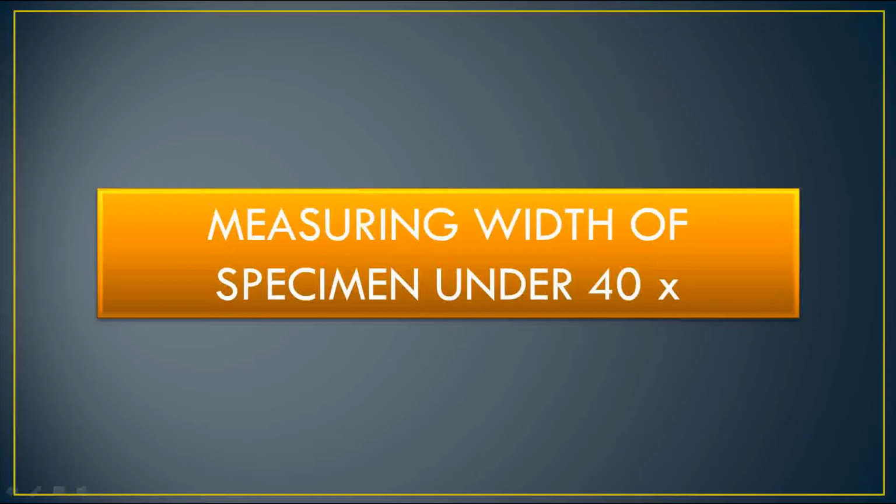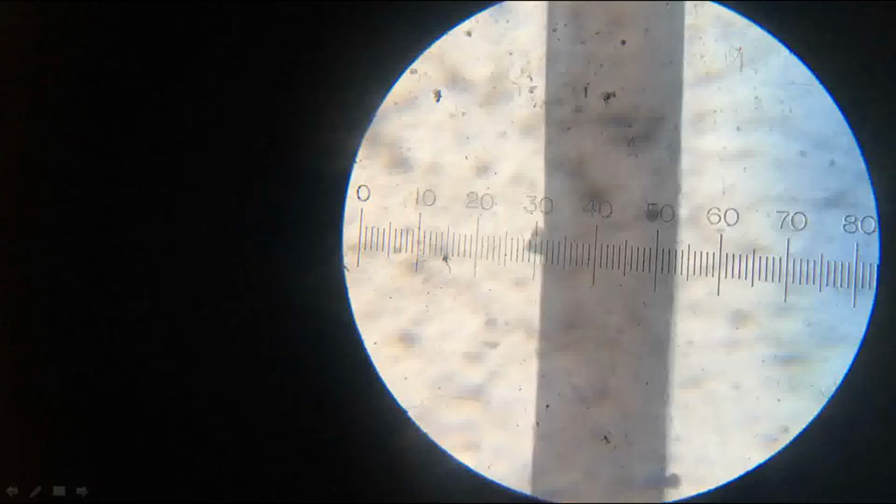Measuring the width of specimen. For that, as I explained to you before, take a hair, means that the same hair that we used under the 10x, that itself we need to place in a clean slide and to view it by keeping it under the 40x objective. Then we can see that in this 4. Here also we need to count the divisions covered by that hair.